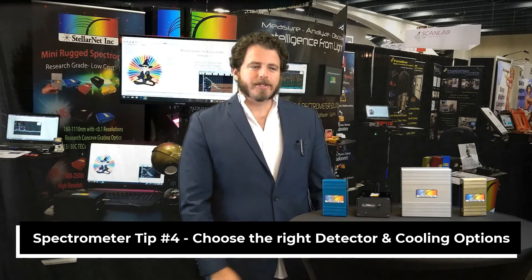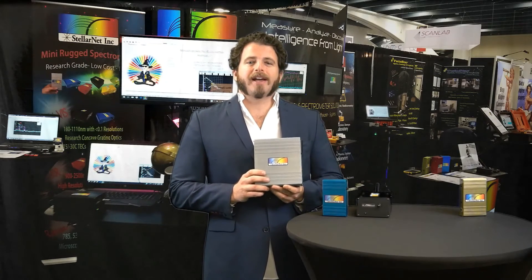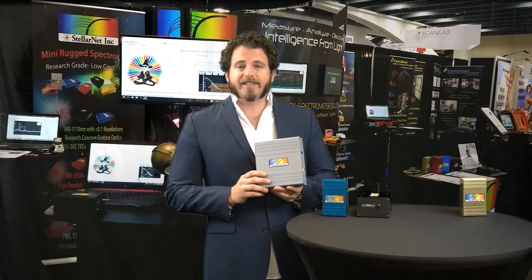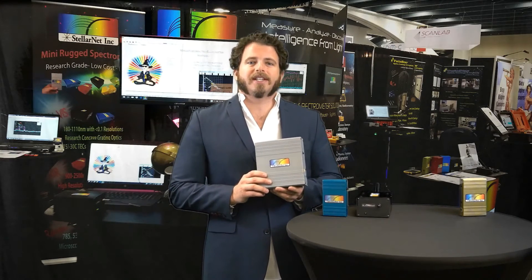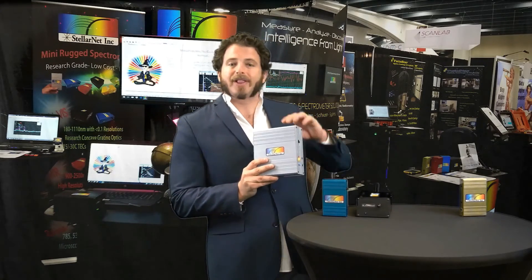Spectrometer tip number four: choose the best detector and cooling options for your application. StellarNet offers a variety of detector and cooling packages, and on all detectors we apply a uniformity and sensitivity coating to the detector itself. On spectrometers such as the Raman and SilverNova, we have advanced cooling options. A detector cooler can be one-stage or two-stage, cooling the detector 15 and 30 degrees respectively. This will increase your signal-to-noise by over 80 percent at long integration times, which is great for low-light applications.